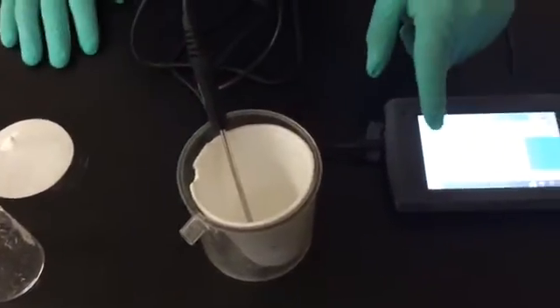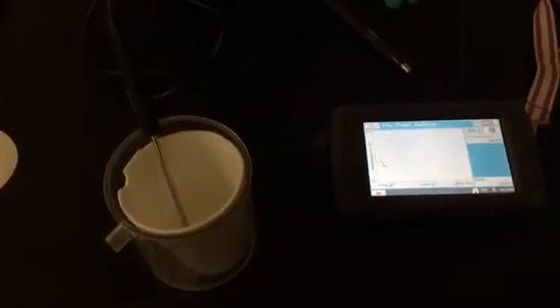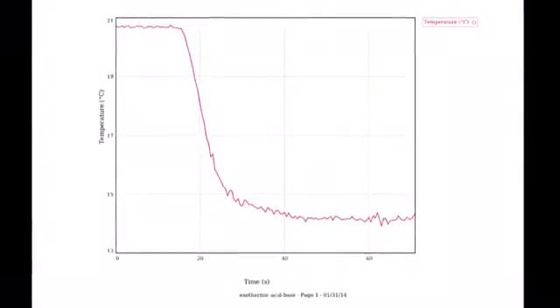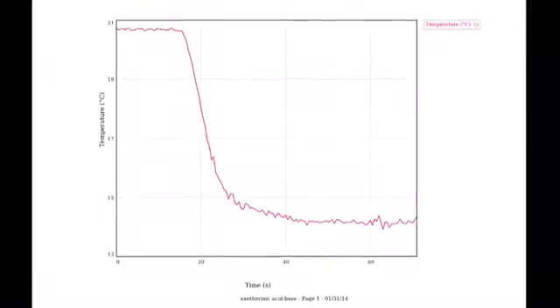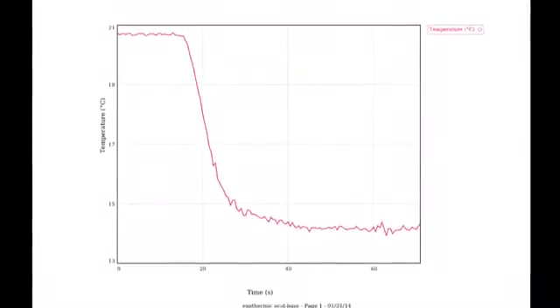Now as you can see, the temperature is dropping, which indicates that this is an endothermic reaction. That means it is taking energy from the surroundings and putting it into the solution. Here are the graphs of the endothermic reaction.